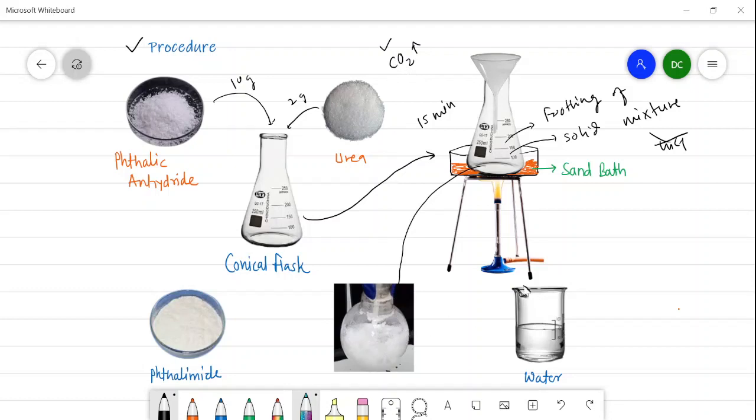Then 10 ml water is added into this product and it is filtered. Then the simple procedure is there: filter, then it is washed with water and dried. When 10 ml water is added, after the addition of water we have to filter this product, then it is washed with water and dried to get a crude product. Suppose the weight of this product is found to be 9.1 gram.